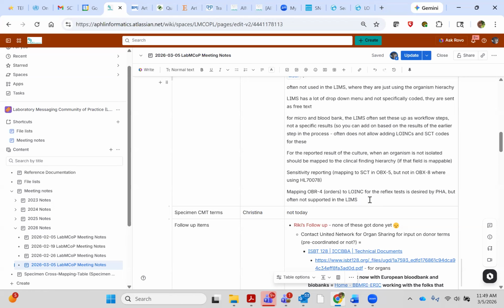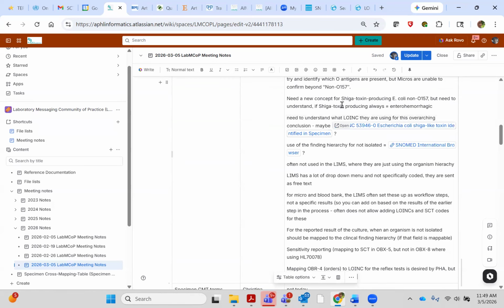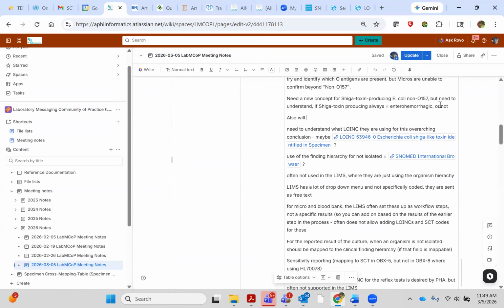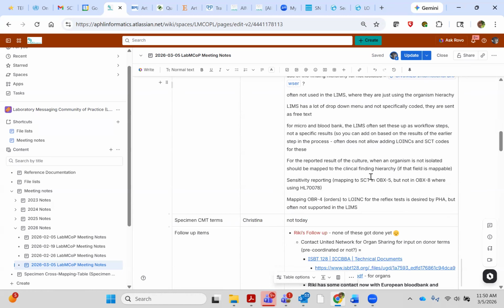But yeah, with those interpretations, if we could get the LIS vendors to support SNOMED codes, that would be a good step forward too. And part of this, like with USCDI, is how they interpret things and thus their functionality. I've heard from some vendors, even with some of the LOINC things, John, you probably heard me talk about at the LOINC meeting, just supporting the long name. When Meaningful Use came out, it wasn't until LOINC changed to the 212 character field for all of the LOINC fields that, once they realized that, they had to put it on their roadmap.